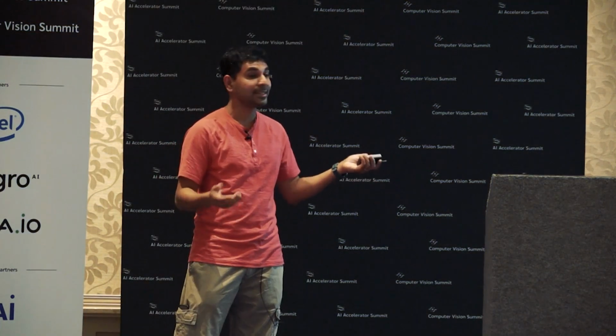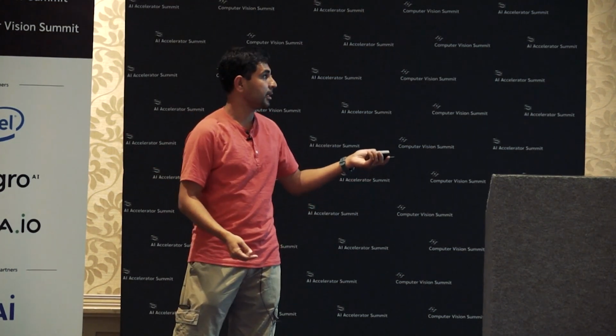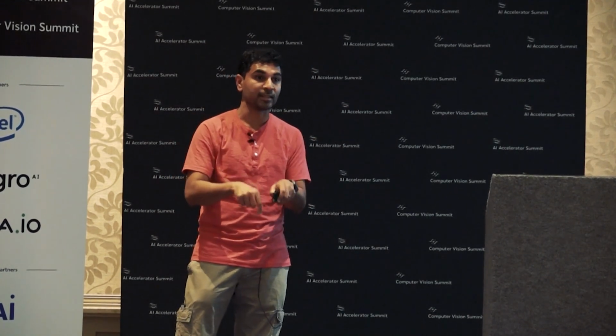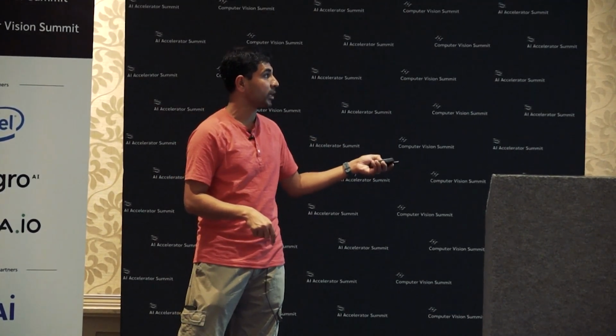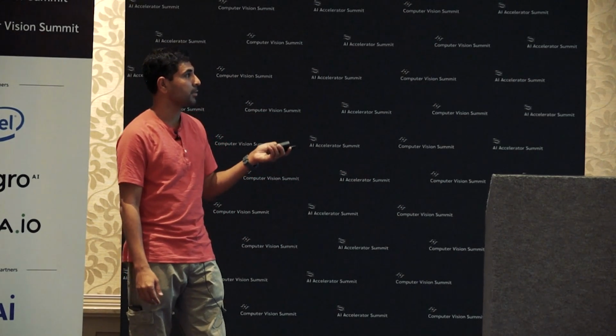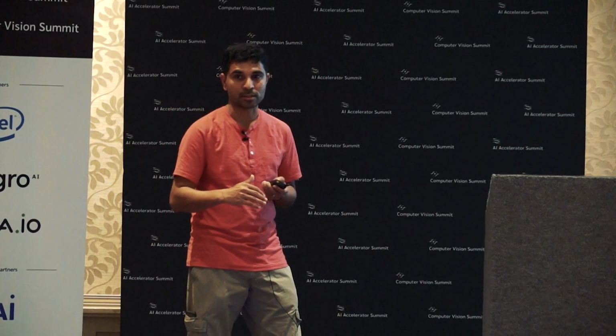So you can train a 3D U-Net that acts as an image reconstruction model, and that 3D U-Net is learning structures in the bright field that are not perceptible to the human eye, but information-wise are still present in the bright field image, and it's able to predict the fluorescence target in the cell with relatively high accuracy. So I guess what we have achieved here is, without having to shine laser light on these cells, through just bright field imaging, we are able to visualize what some of the internal structures are going to look like.